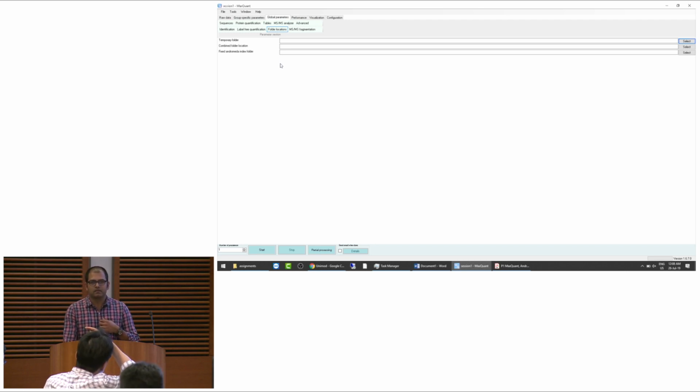Yeah. So if you have an unspecific search, for example peptidome analysis, then the step of preparing the search might actually take long. If you use exactly the same parameters every time with different files, MaxQuant creates these search folders, and they can be reused.